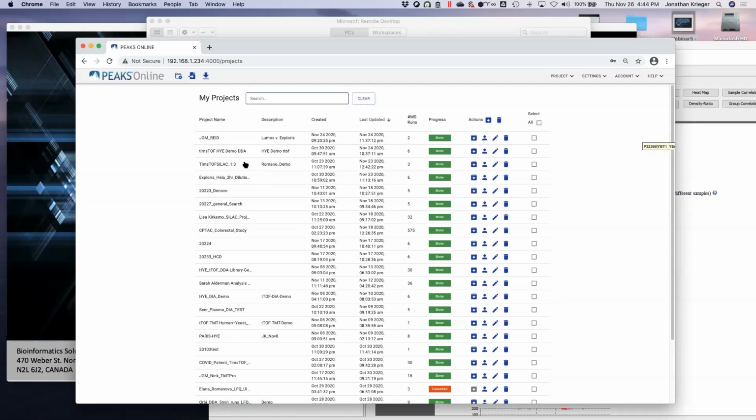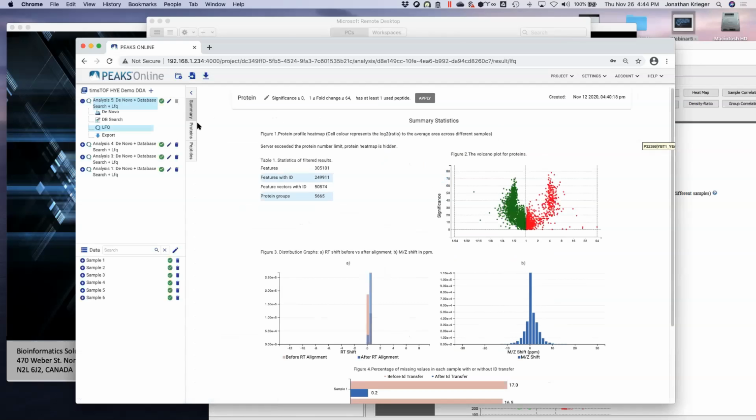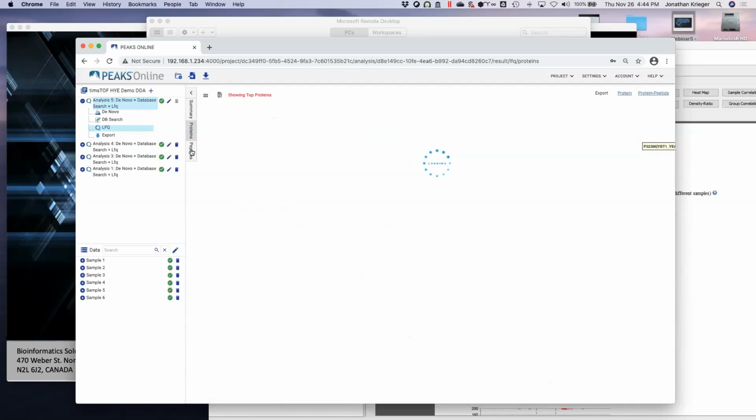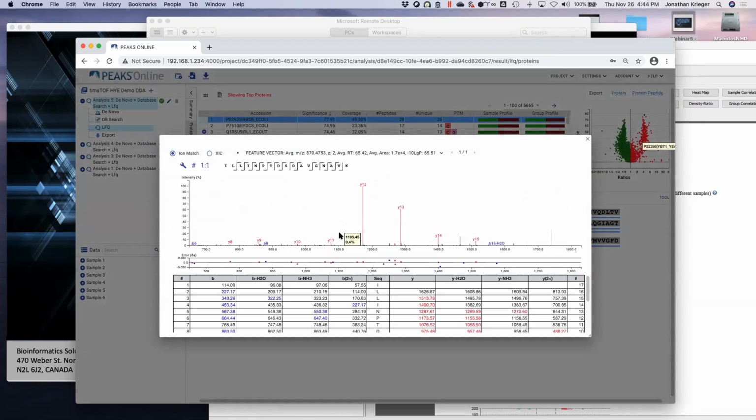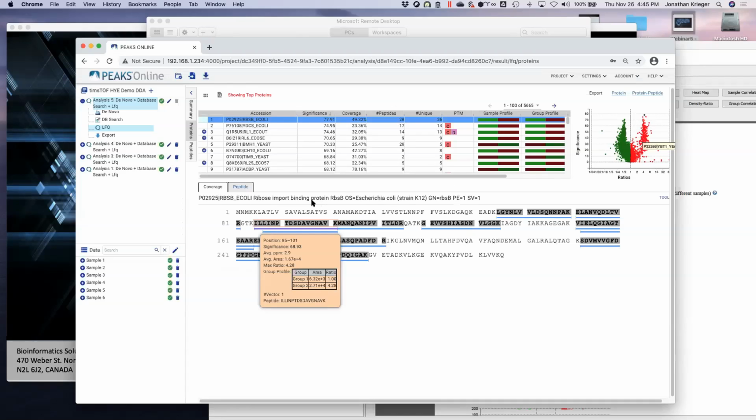Where is the DDA data? If you pick any in the ion match. So in the older versions of the software, before we had that reader, you'd see all the little sticks that contribute to these ions in the centroiding process. And so what that did is it just created a lot of noise, which reduced quantitation and some ID accuracy. So I think you'll actually find that the IDs are a bit better, and you'll also find that the match between runs probably works a little better in Xpro because we have better feature identification.